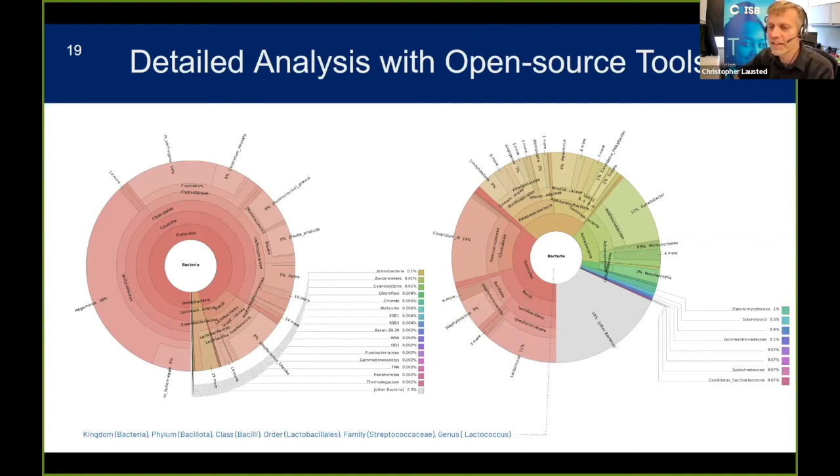Students were very interested when they heard the name of a potential pathogen, but they also noted that only certain subspecies of each of these actually cause disease. And so you really need more sequencing beyond just the 16S gene to know whether the particular bug you have is pathogenic or not. But they were very interested to see that some of the other pets had higher counts of potentially pathogenic species like Salmonella. The bearded dragon sample was particularly high in Salmonella, 4%, but it was a very healthy lizard.